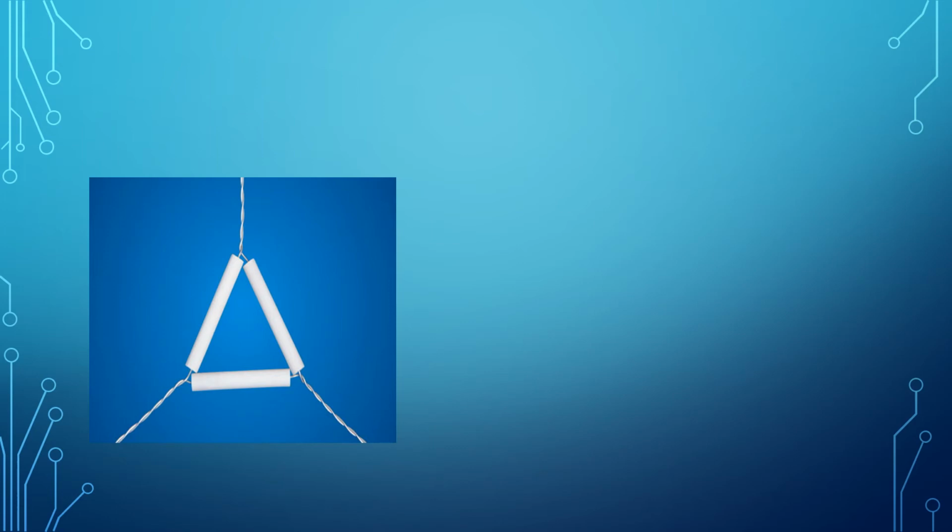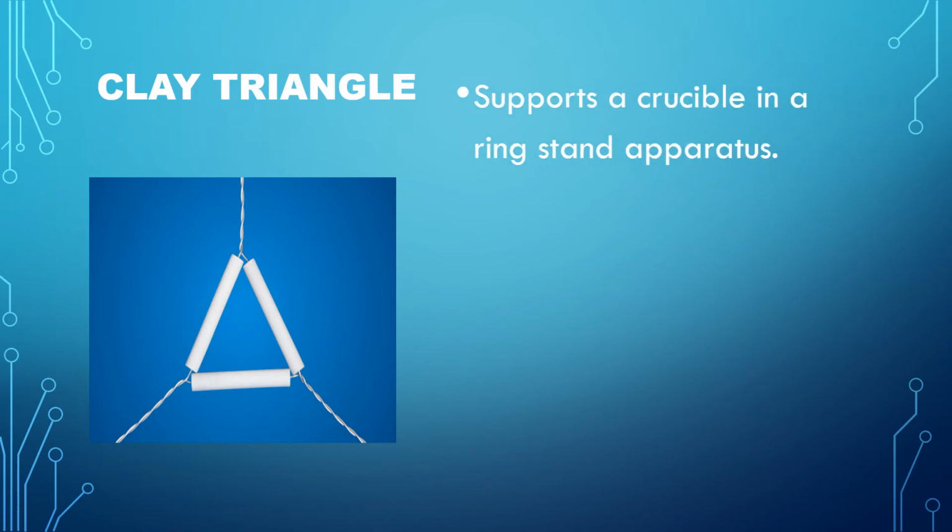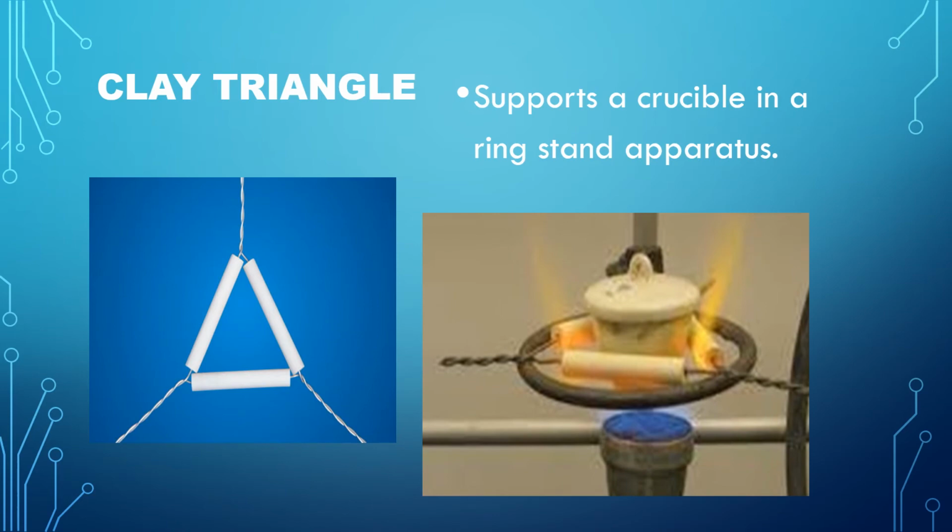So what is this? It is also clay triangle. So the name of this is a clay triangle. It is used to support a crucible in a ring stand apparatus. So let us see the setup here. So there, you can see the clay triangle here, and then the crucible and lid.